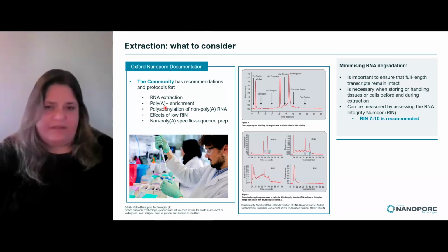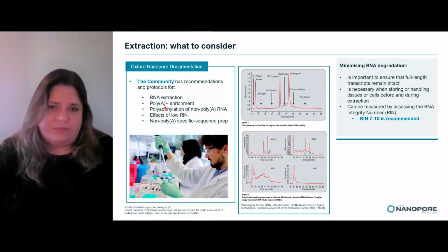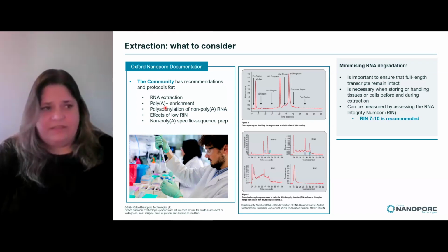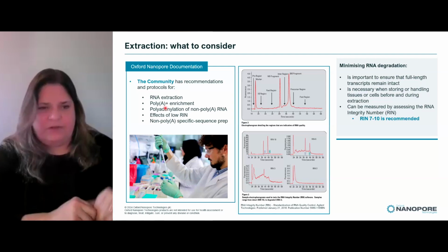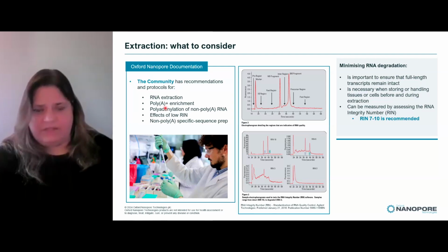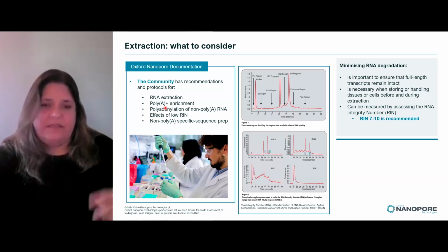So we have methodologies of looking at poly-A enrichment, and that's either through enriching for poly-A specifically using something like an oligo dT pull down, or ribosomal depletion. With oligo dT beads, you poly-A select things that have a poly-A tail, which are usually messenger RNAs, also long non-coding RNAs.